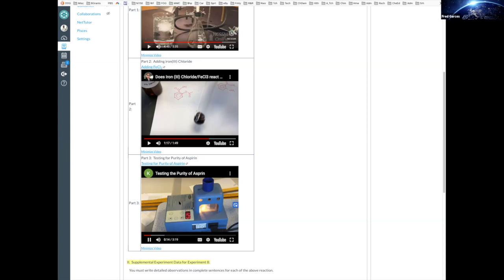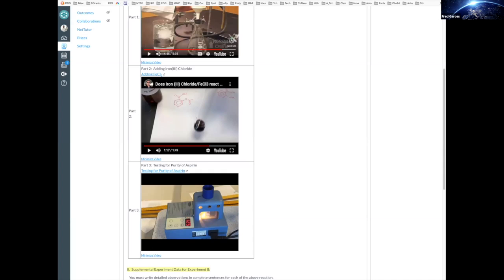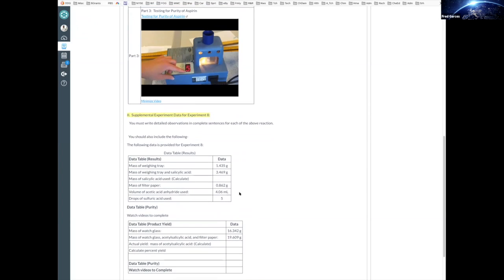Let me quiet that. So you want to watch these videos, and then you want to write your experimental observations based on what was happening in the video. Then you want to use these data. These are the data that you guys are going to be using for your calculation. The mass of the weighing tray, the mass of the weighing tray plus salicylic acid, so you can figure out the mass of the salicylic acid.